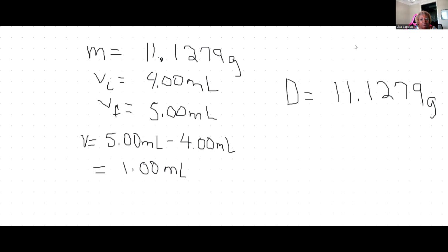And then we are going to divide that by the volume that we got after we subtracted, because that is the actual volume for the sample. So 1.00 milliliters. M capital L, lowercase m, capital L, that is the abbreviation for milliliters. So when we do the math for this, obviously anytime we divide by 1, we're going to have the same number.